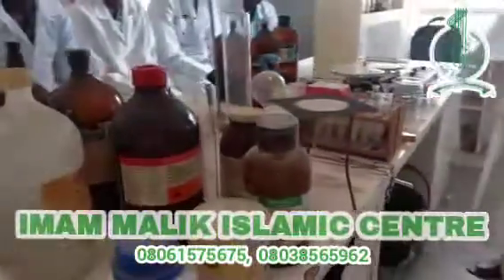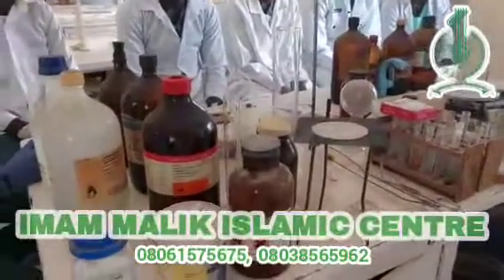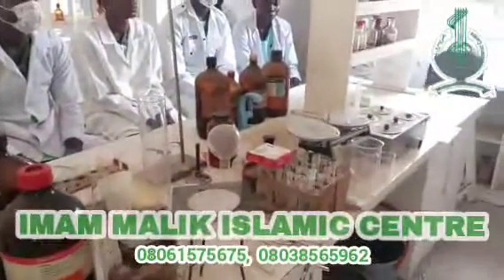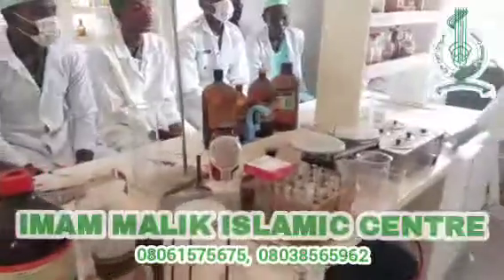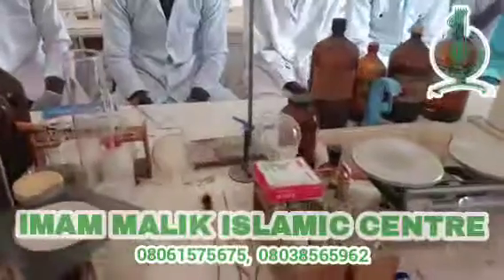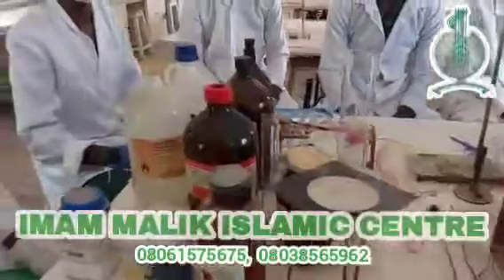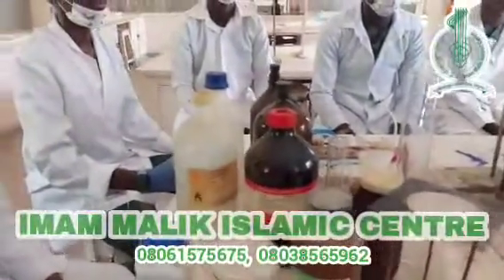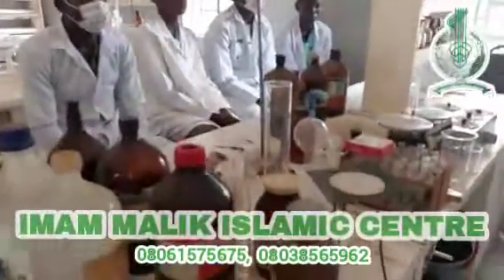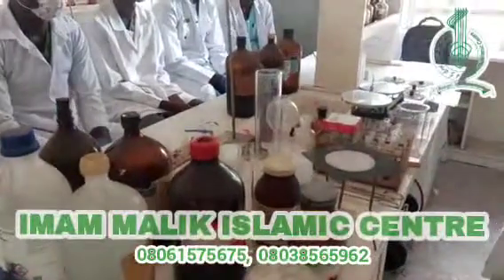We start with the equipments that can be found in a chemistry laboratory. So there are so many equipments to be found in different laboratories, depending on the laboratory. Basically our own discussion will lie on the chemistry laboratory. So as we mentioned earlier, the essential equipments in the laboratory include the crucibles, the funnel, the watch glass, the beakers, the bottles, the flasks. You can see there are many here. So we are going to take one after the other. At least we give one or two functions of each.